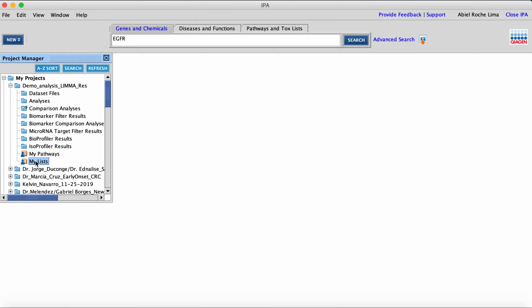That is helpful when you already have a dataset and you want to predict what proteins from your dataset are interacting with a protein of interest, or that list of proteins or genes of your interest, even if you don't see it in your dataset.